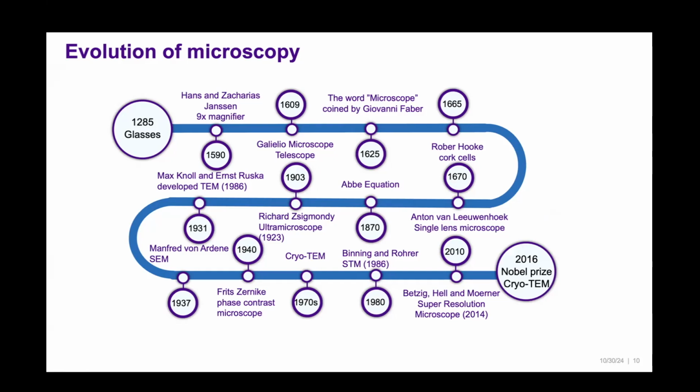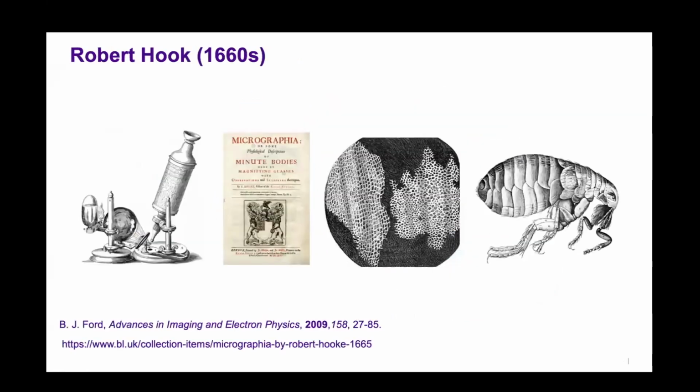In 1931, the first electron microscope was developed. So then you can go beyond light microscope resolution. You can see even smaller objects. Several Nobel Prizes were awarded for this, in 1986, and then there is more and more. There are two more Nobel Prizes, for cryo-TEM and also for the scanning tunneling microscope and AFM. We will look at all of this. Let us look at how it has developed.